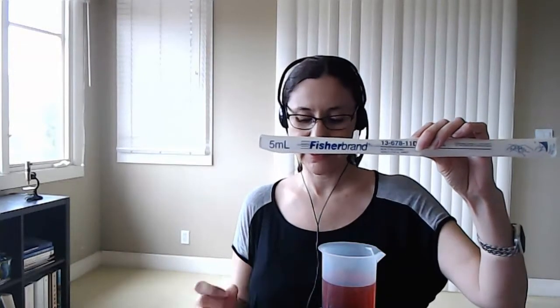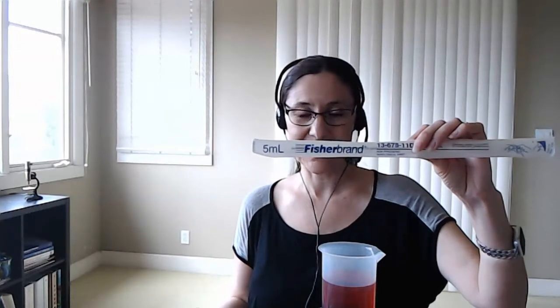Now, these pipettes come in various different sizes. Here you see that this is a 5 ml pipette that can deliver solutions in 1 ml increments, you can also do decimals. This is a 10 ml pipette that can transfer up to 10 milliliters of whatever culture you're trying to transfer. And then we also have a smaller 1 ml pipette that can transfer microorganisms, solutions, media in increments of 0.1 ml. So depending on what the needs are, we have different pipettes to be utilized.